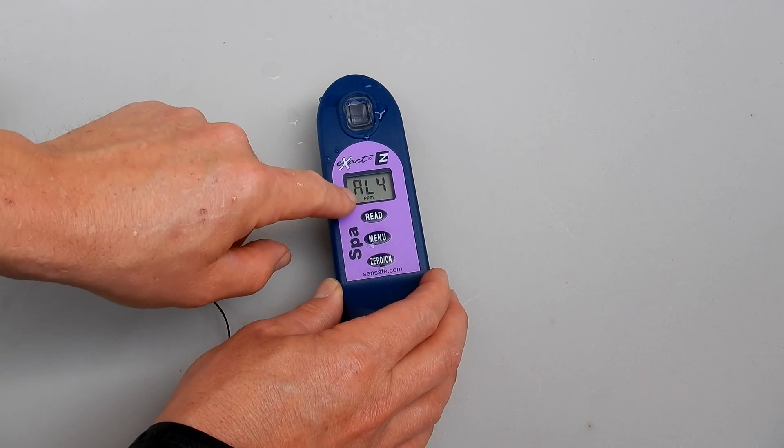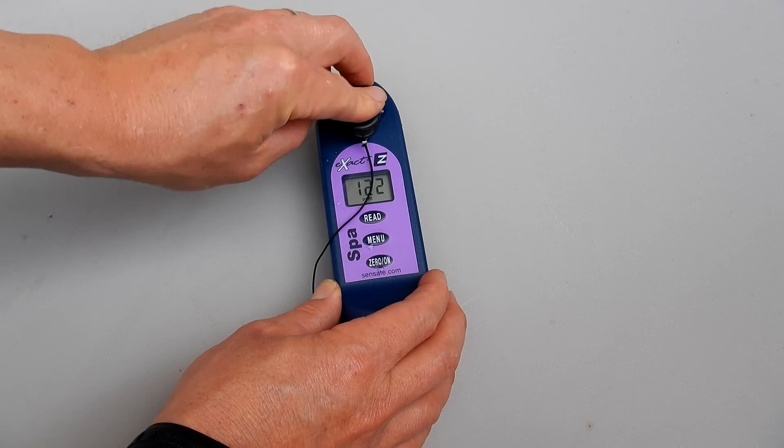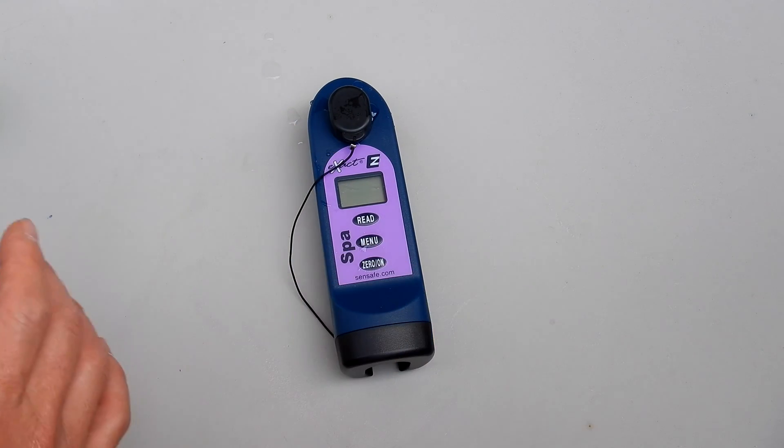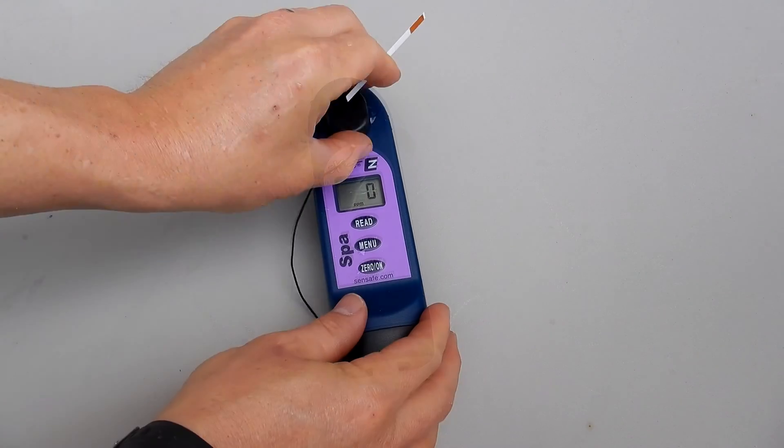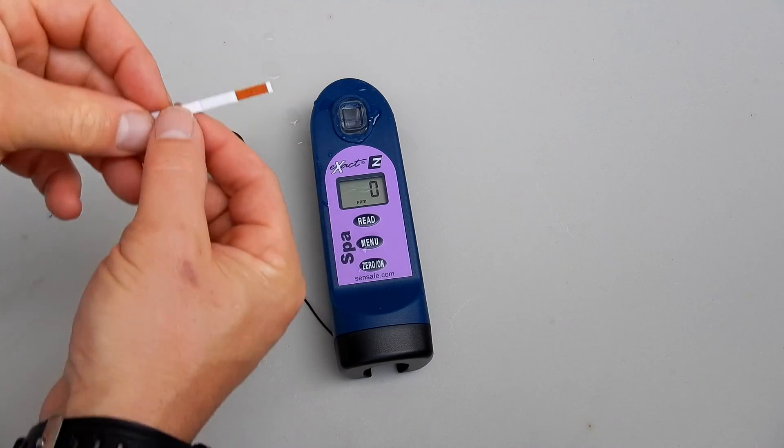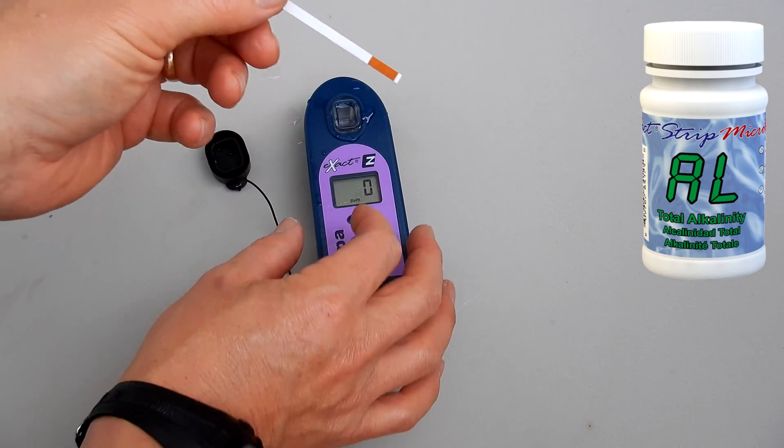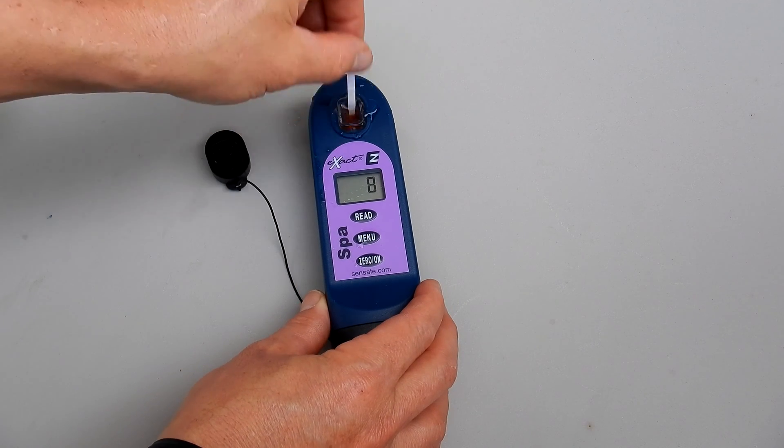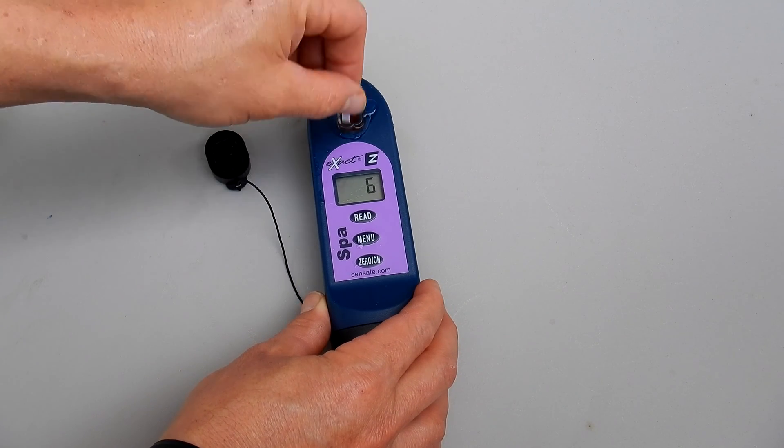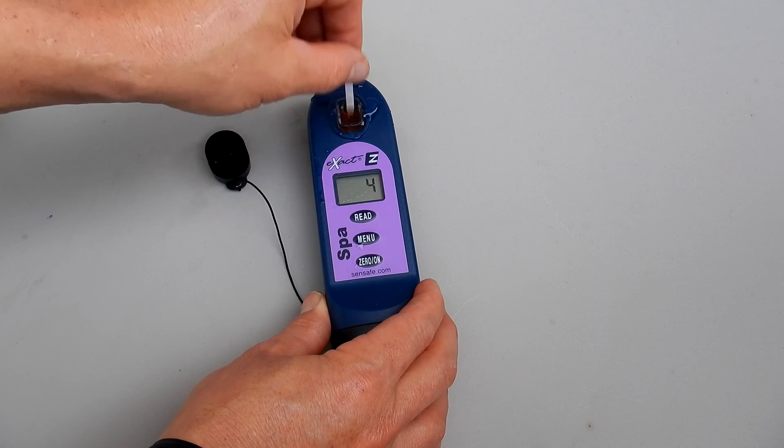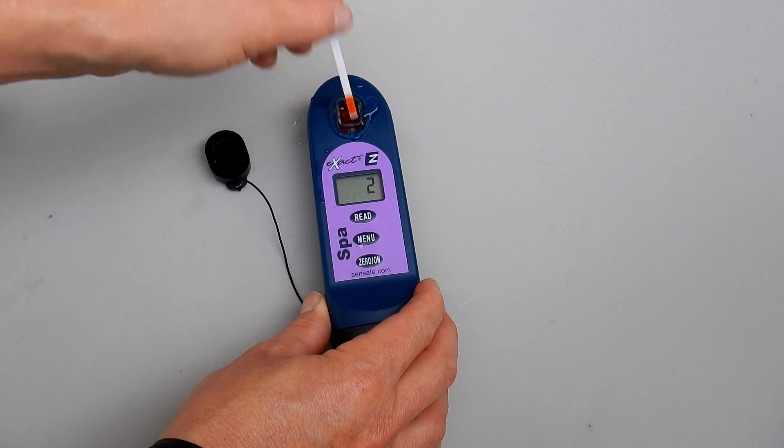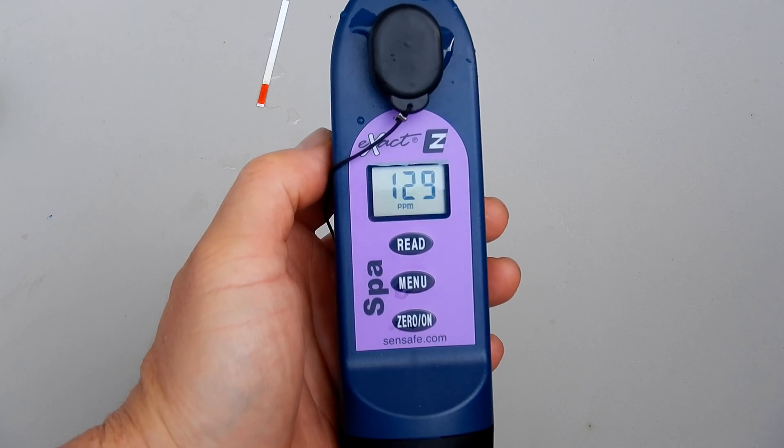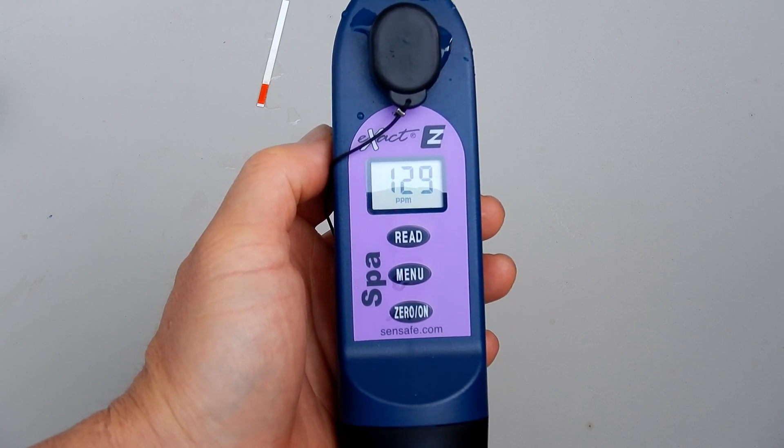Now you want to scroll over to the test. I'm going to go ahead and do the alkalinity. So AL4. I'll put the cap on and I'll zero out the unit. Now I'm going to take the Exact Strip Micros, go ahead and hit read. You want to move the strip back and forth as it's counting down. When it gets to one you want to put the cap on. The alkalinity here is 129 parts per million.